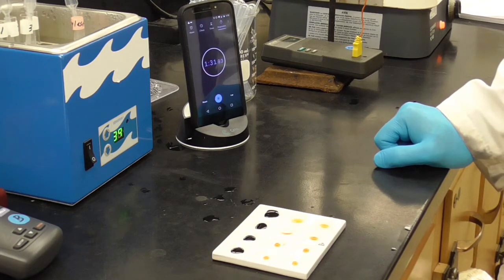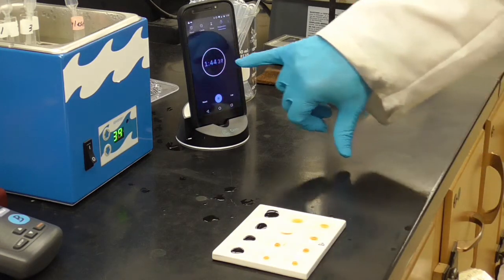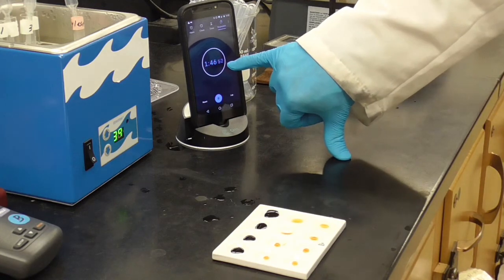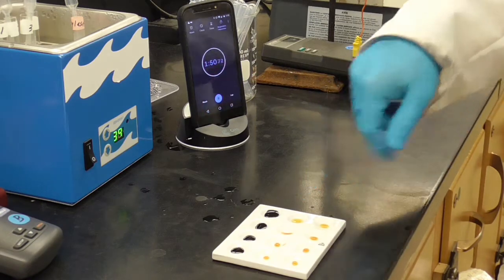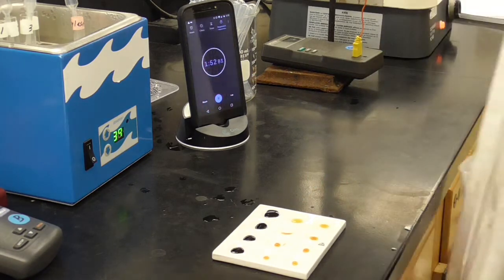Enzymes do take a little bit of time. Some of them can be very, very fast in the body, but within a couple minutes, that's probably pretty average for an enzyme to work on its substrate. And that's what we're doing right now. We're just waiting for about 4 minutes and 30 seconds, which actually will be 5 minutes according to the procedure, then we'll try again and we'll see, do we have activity?